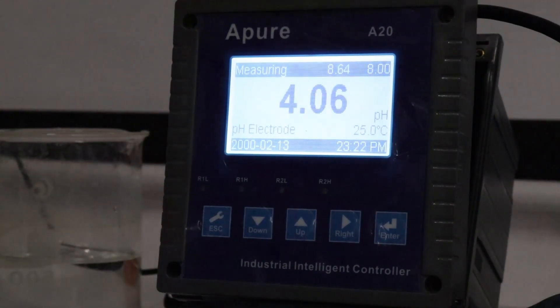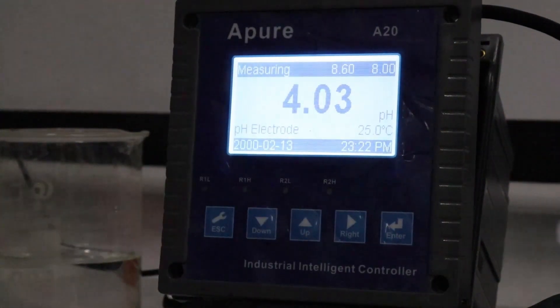3-relay switching output contacts provide more control flexibility and smooth operation.